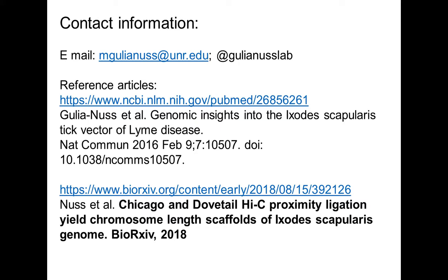That's a great question. So as Mark earlier said, I'm going to start from the previous question, just add a little bit on the challenges in getting a good assembly. So we work on non-model organisms, and non-model organisms, as you all might know, don't follow the same rules as the model organisms most of the time, and that's quite a big challenge.